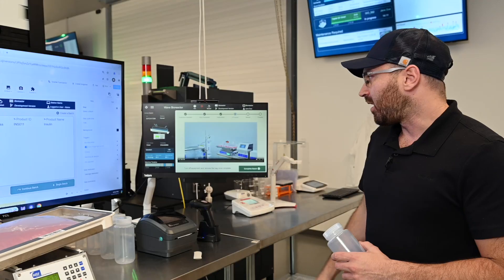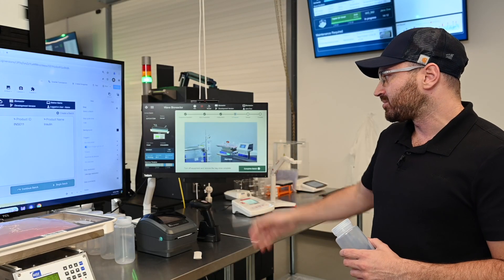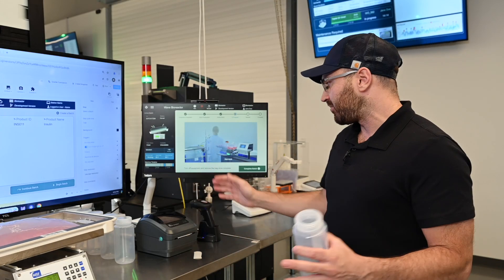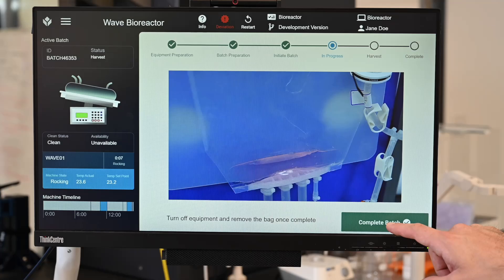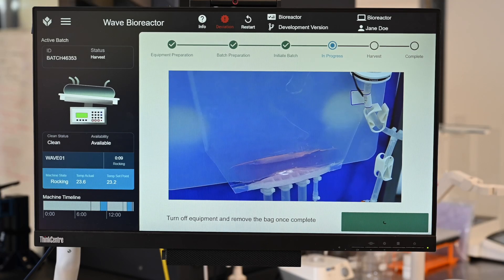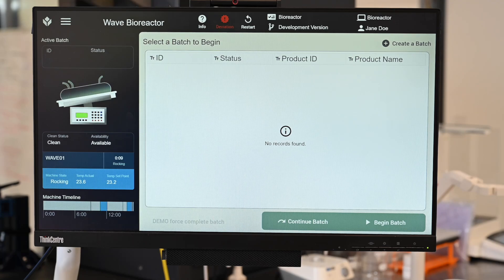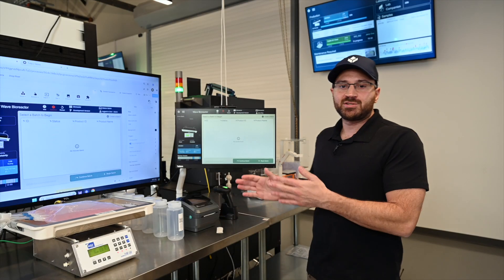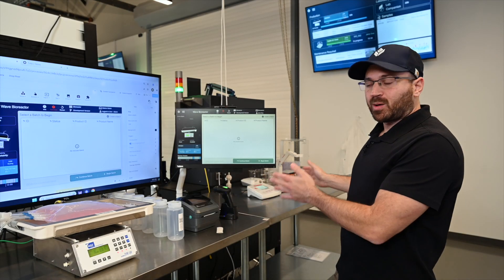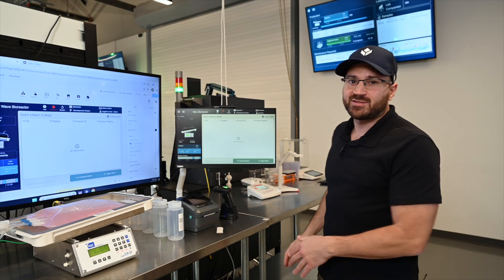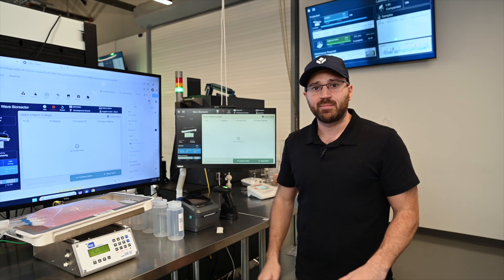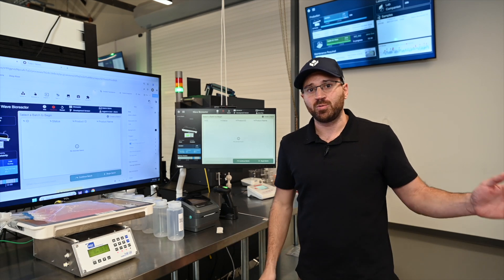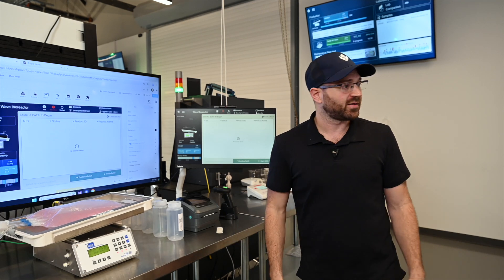Harvesting is going to have some more instructions on how to empty the bag and stop the process and I'll complete that batch. So now that we've harvested the batch, it actually should normally go through a number of different processes. But to simplify this demo, we're just going to go right to the batch review and show you what that could look like.